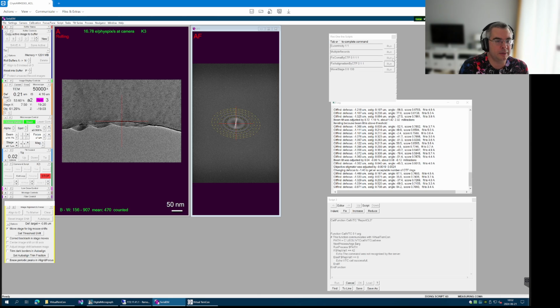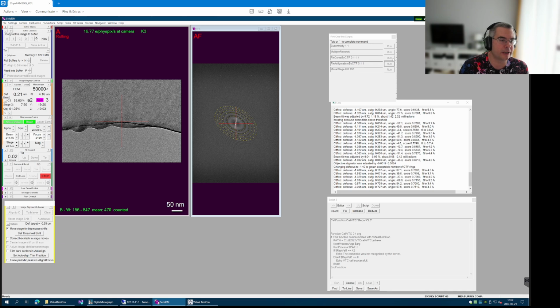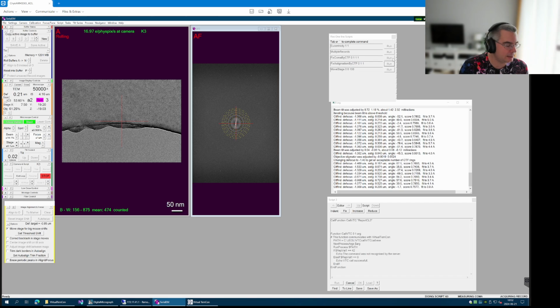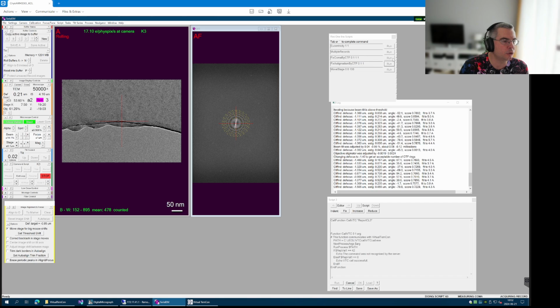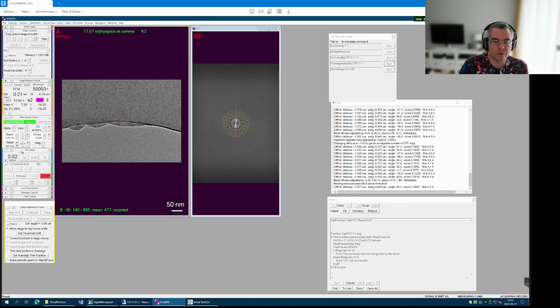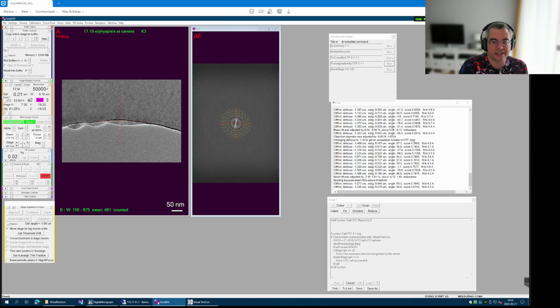And here the beam tilt is quite substantial. I can see the FFT disappearing at the longer apex. So yeah, but again, this is totally expected at 4 microns uncorrected image shift. Right, so it has to go for the second round.